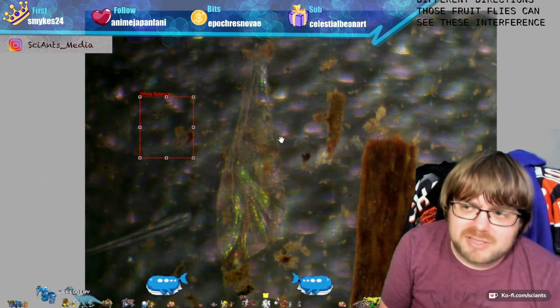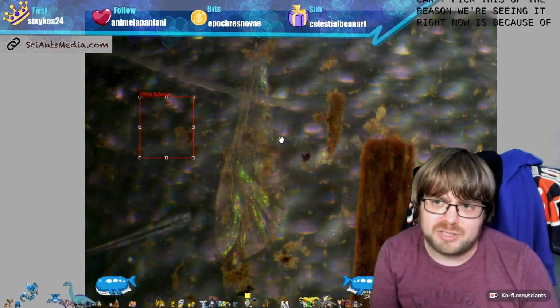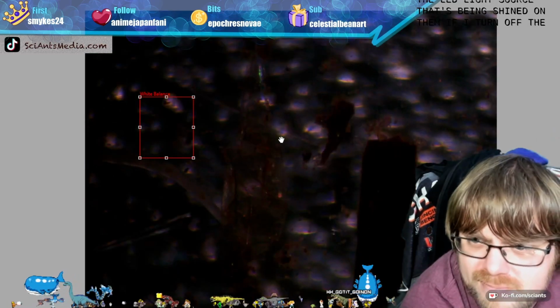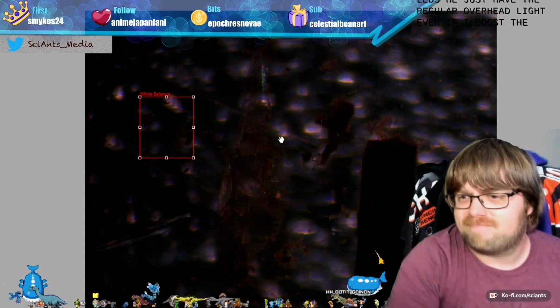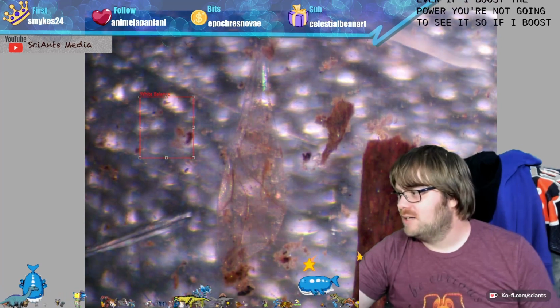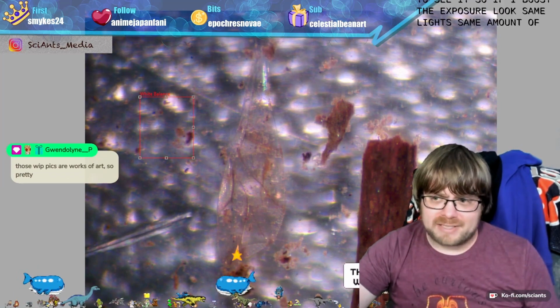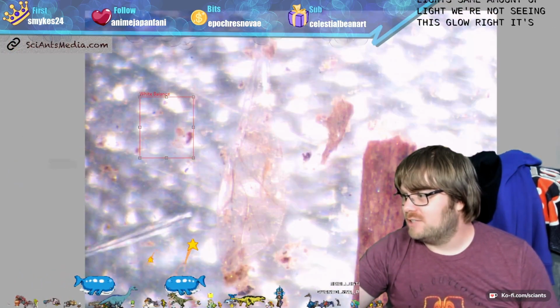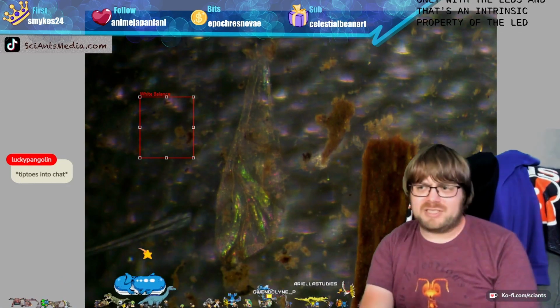You and I, if we're outside, our eyes can't pick this up. The reason we're seeing it right now is because of the LED light source that's being shined on them. If I turn off the LEDs, you just have the regular overhead light, even if I boost the power, you're not going to see it. If I boost the exposure, look, same amount of light, we're not seeing this glow, right? It's only with the LEDs, and that's an intrinsic property of the LED lights that we're able to see this kind of light source.